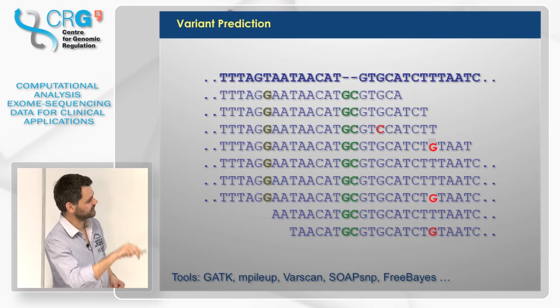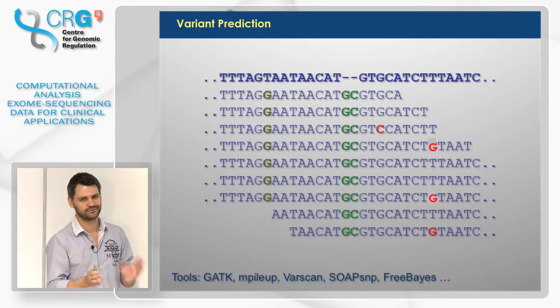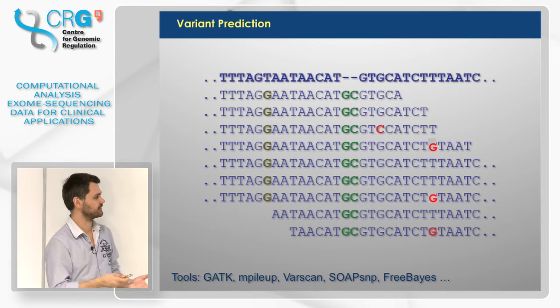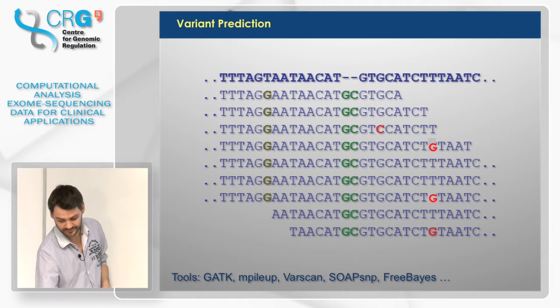Most of the tools automatically also do short indels. Short indels is everything up to roughly 10. Nowadays a bit longer. BWA now aligns also up to 50 base pair gaps. So many of the tools now automatically look for these inserted or deleted sequences and give you exactly the same information as for the SNPs.